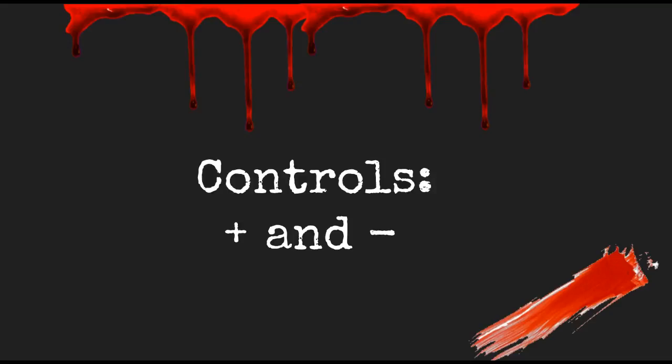Don't forget about your controls. You're going to always need to start out by running a positive and a negative. That way, again, we know what a positive test looks like, and we also know that our test is working. It's also showing us what a negative reaction looks like, and making sure we don't have any contamination in our reagents or our dropper bottles or our Q-tips or anything like that.